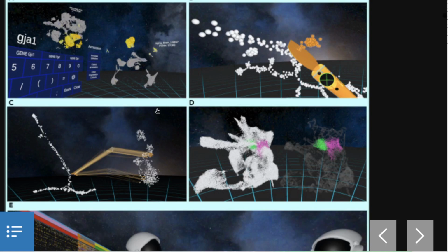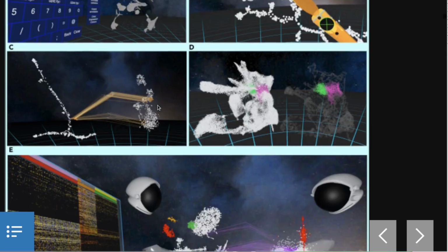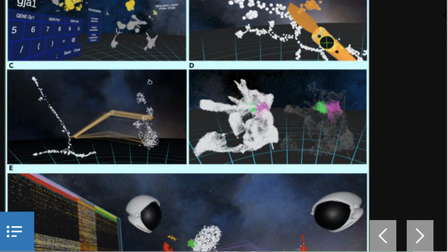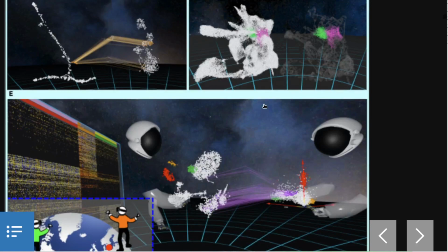Cells captured in one DR plot can also be traced to their counterparts in other DR plots to visually assess the differences between them, Figure 3C. Here, cells captured from a tree of mouse hematopoietic stem and progenitor cells split into two groups in a graph made from the same cells. Furthermore, using the selection tool, the cells forming the split can be captured using the centrally generated graph to then determine which genes are differentially expressed between the two, Video S2.